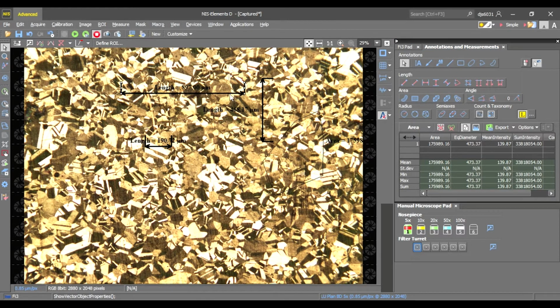If you click on the actual arrow and click properties, you can change the line color, line width, anything you want really. There's lots of ways to personalize this or make it look nice. So that's just up to you to figure out what your preference is. I have mine edited here to my preference with the mostly black. If I want to see it a little bit better, sometimes I put on a white background so that it shows up.